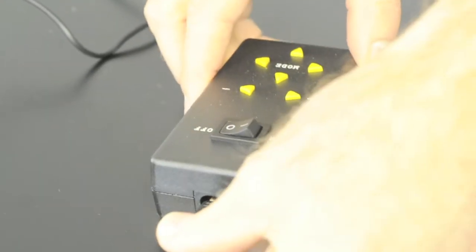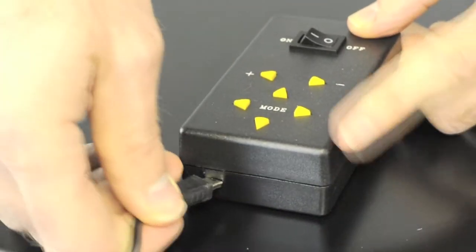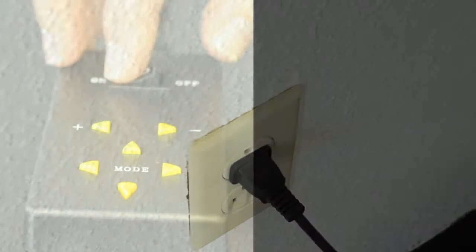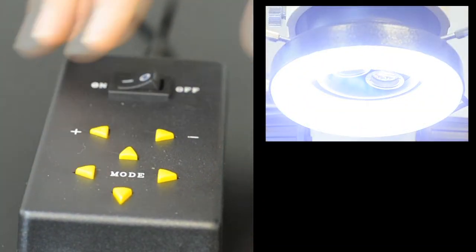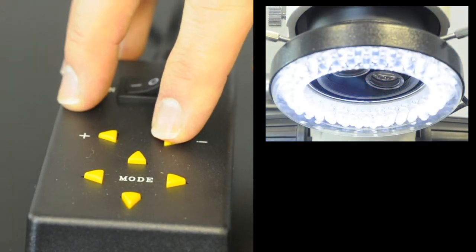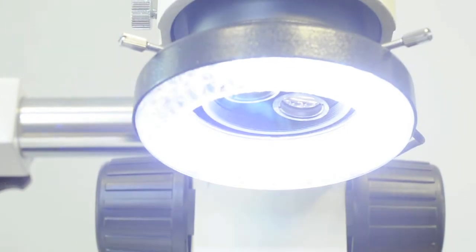The supplied power module offers a number of unique adjustments. The intensity can be adjusted in a series of steps and each of the four quadrants of the ring can be independently enabled or disabled to help with the reduction of glare in certain circumstances.